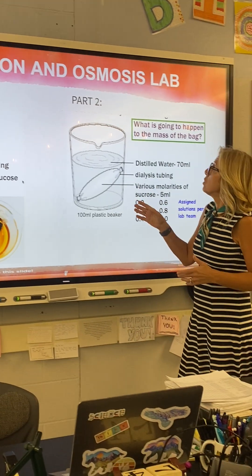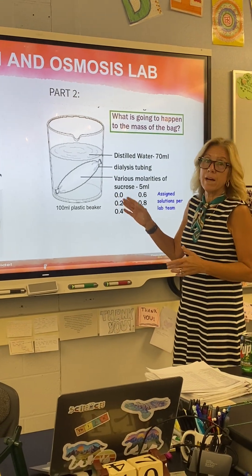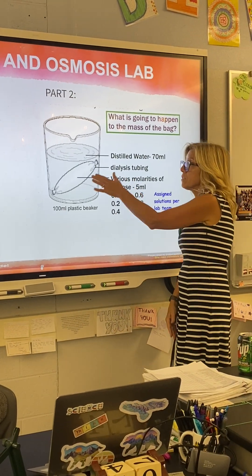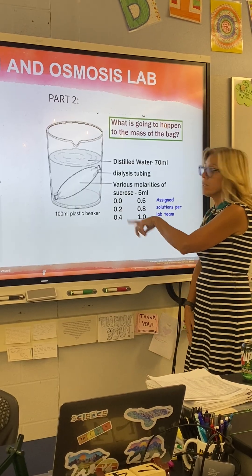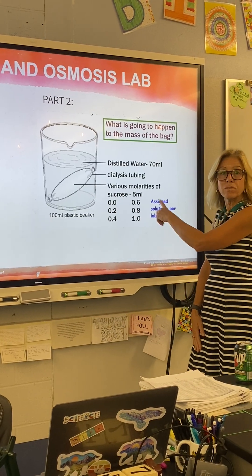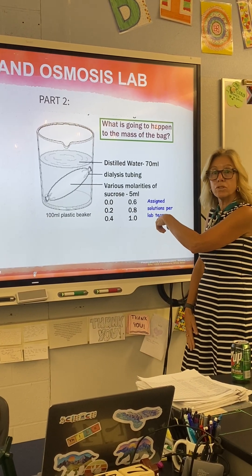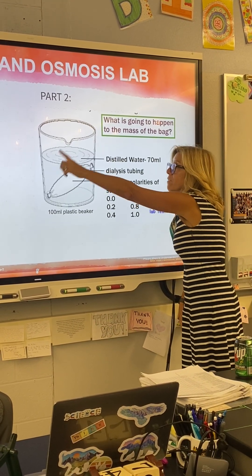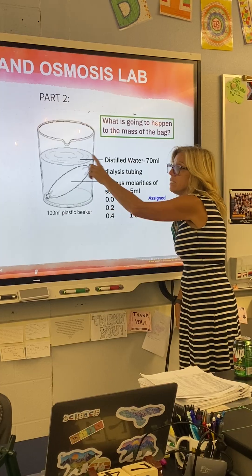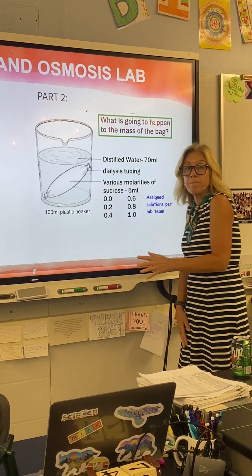Part two of the lab you use dialysis tubing again, but this time you put in various concentrations of sucrose solution inside the tubing and then they all sit in distilled water.